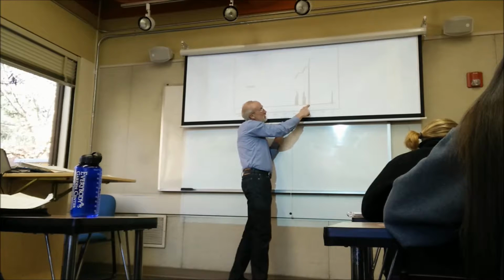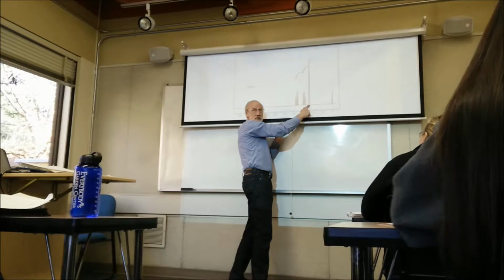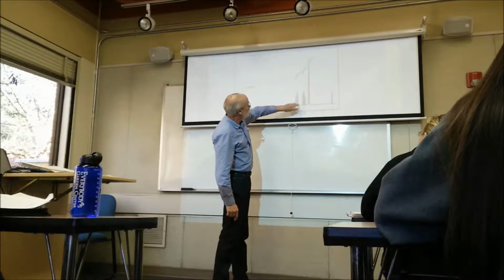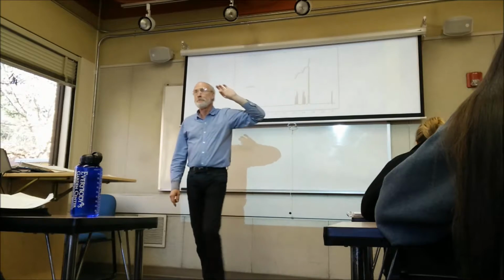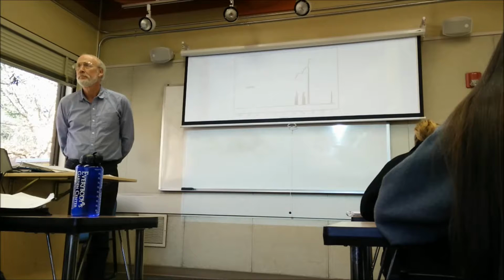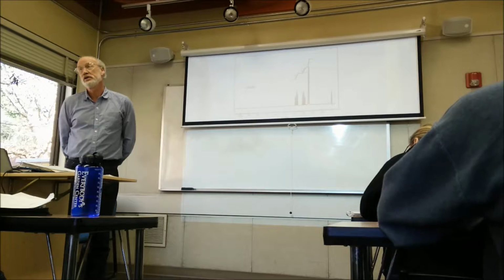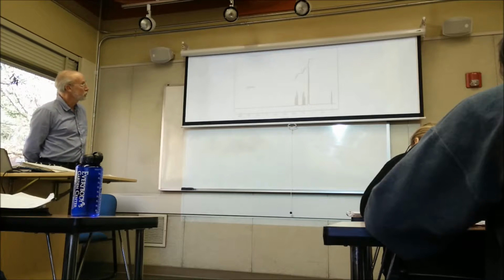Okay? And what do you make of this thing? That's more hydrogen. The what? Now, alcohols are around here. That's wide. I thought alcohols had, I don't know what the range of alcohols is, but when I was looking at it on the sheet, it looked like it had a really wide range. Yeah, alcohols do have a really wide range. Okay. So if I looked at that, I would think that it was an alcohol.